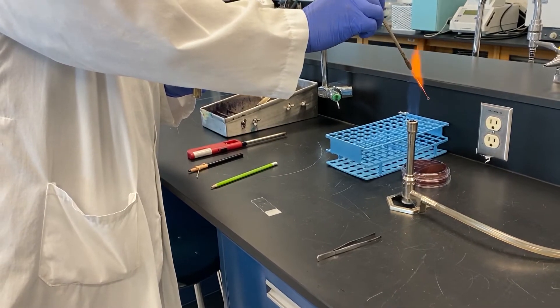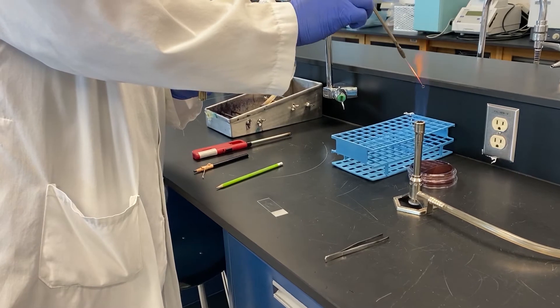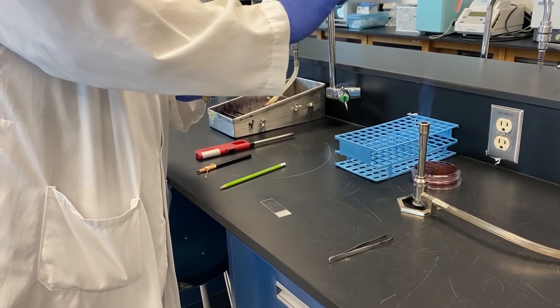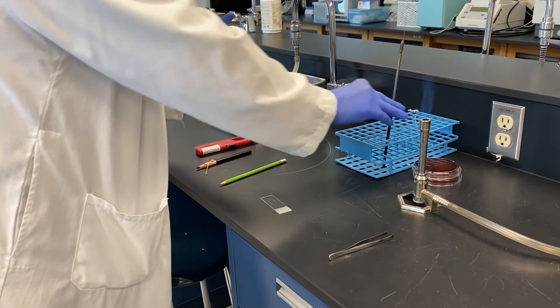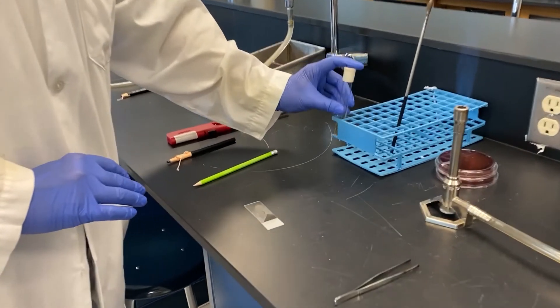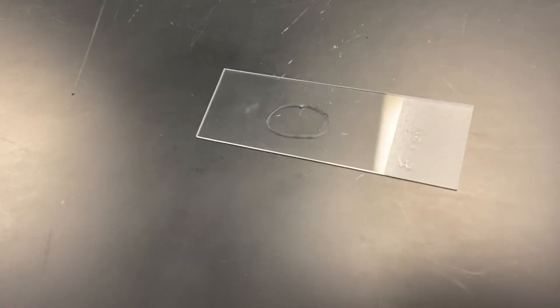When you are done adding your culture to the slide make sure you sterilize your loop before putting it away. Test tube racks make a great tool for storing your loop while working at the bench. This slide is now ready to be heat fixed. We'll show you how to do that in just a minute.